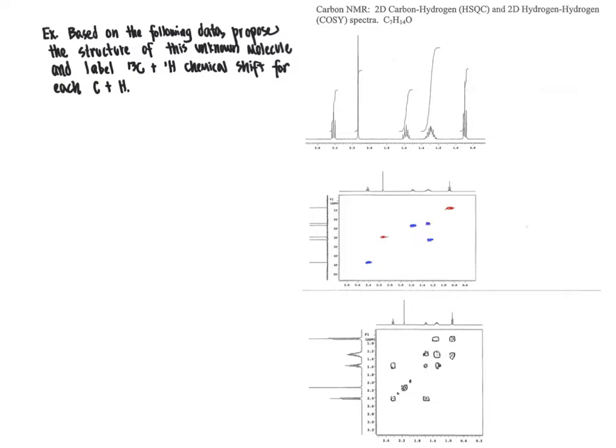There are also additional example problems available on Canvas under this module that will give you extra practice at interpreting NMR data and using similar strategies for solving structures as we are doing here, to enable you to get the practice needed to get more proficient at this, because definitely solving NMR structures is one of those things where the more you do it, the sharper you get at doing it, and the more readily you'll be able to tie together the different types of NMR data to work efficiently toward coming up with complete chemical structures.